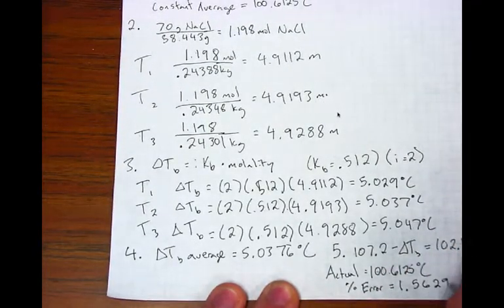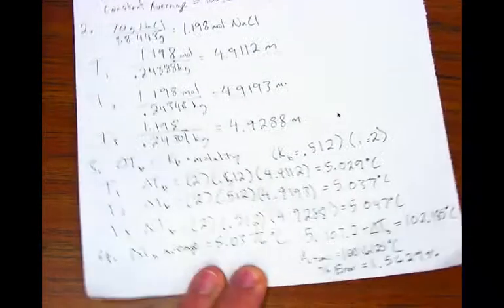As you can see, our percent error was 1.5629%, which is reasonable.